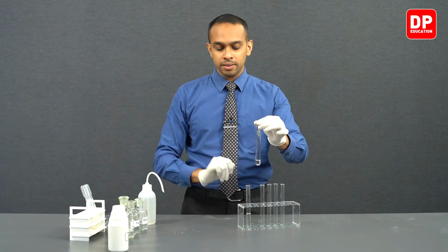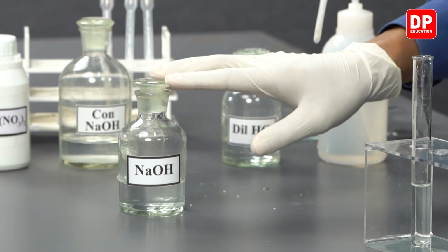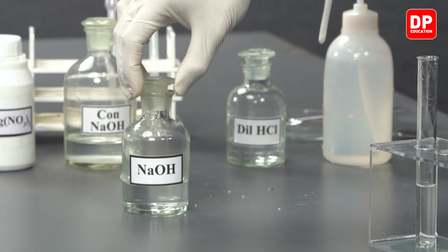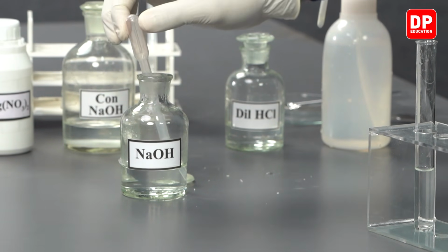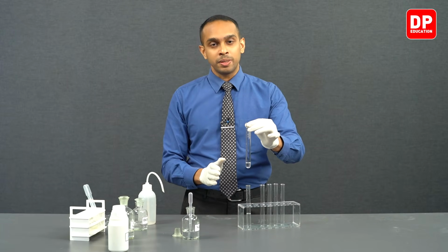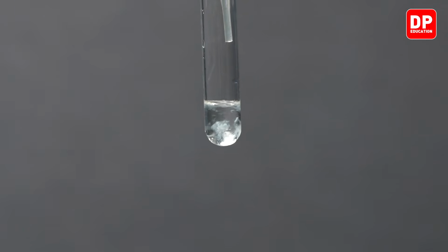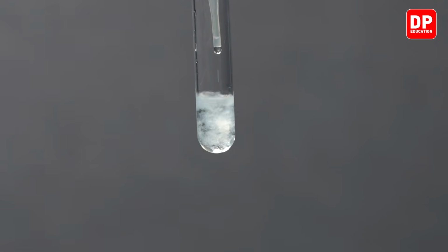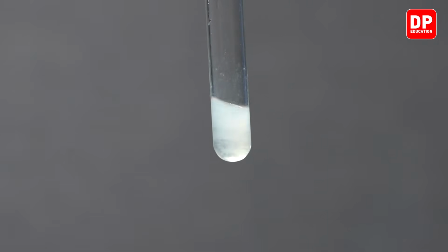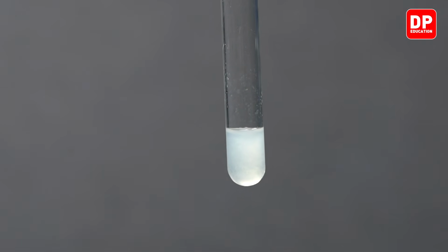And we are going to add a very small amount of dilute sodium hydroxide. So when you add sodium hydroxide to aluminium 3+ ions, what do you think will happen? Let's observe first. As you add sodium hydroxide to aluminium 3+ ion solution, we can see the formation of a white color precipitate. What is this precipitate? This is aluminium hydroxide.